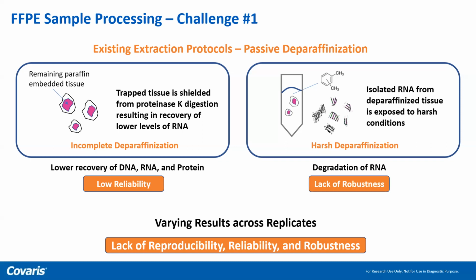So you do not get as good a quality of DNA, RNA, or proteins, whatever you're trying to use. Because if you look at systems biology, the omics people, the metabolomics people will say, we are the king, right? Because we understand the metabolomic profile that is causing the cancer. Proteomics will say, I see the biomarkers. You guys don't, because at the end of the day, you have only a few metabolites. I have specific protein biomarkers. And then the transcriptomics people will say, we look at the RNA, DNA, and the proteins.